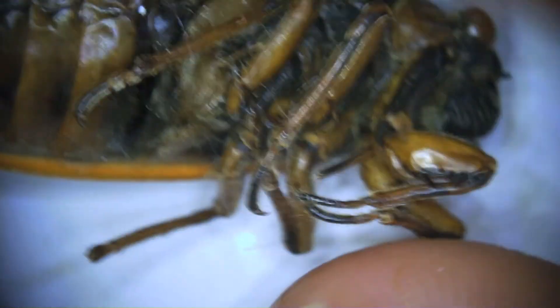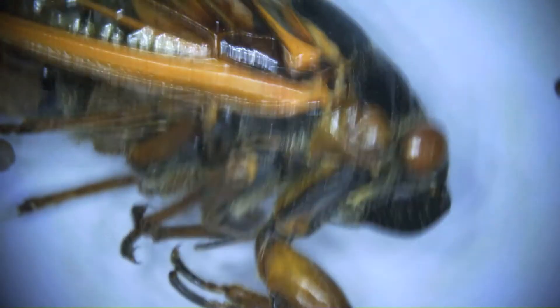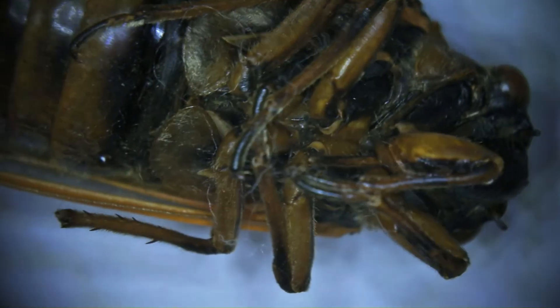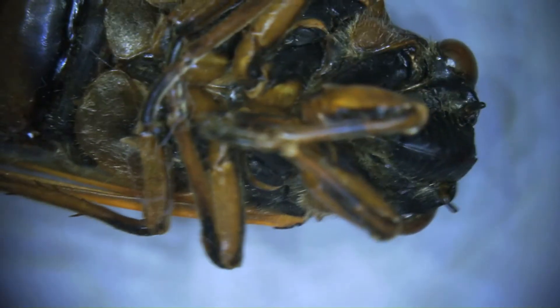Then we flip it over so you can see those legs and where they connect. You can see they're all connecting at that second or middle body part, which is the thorax. Every single true bug has three pairs of legs, or a total of six.